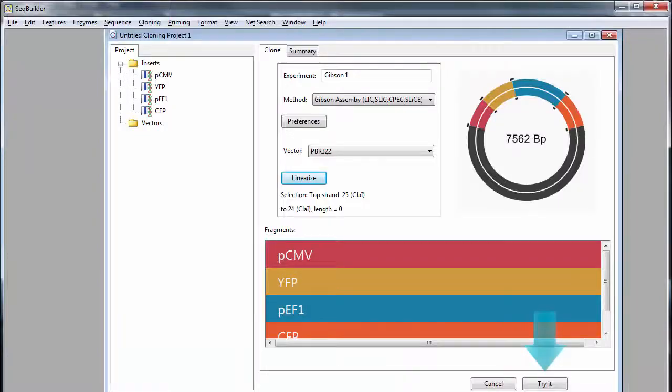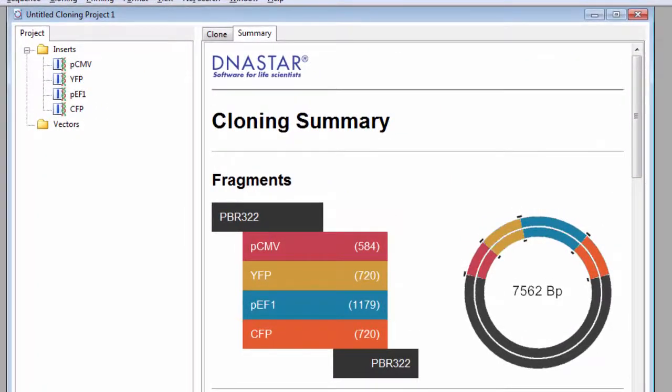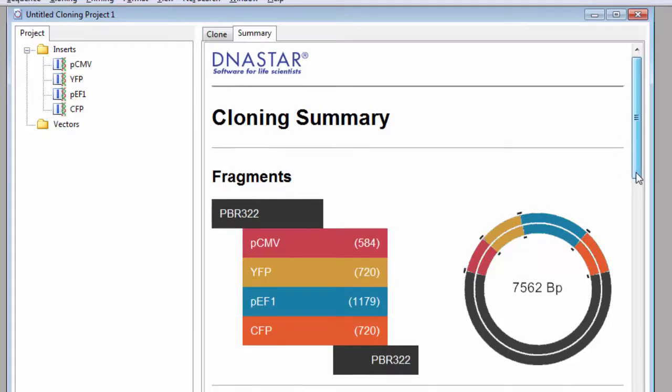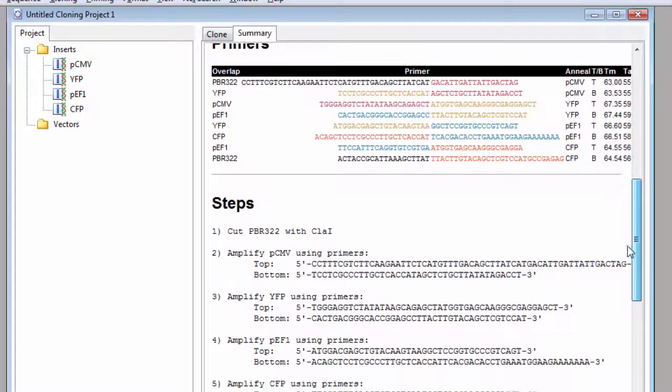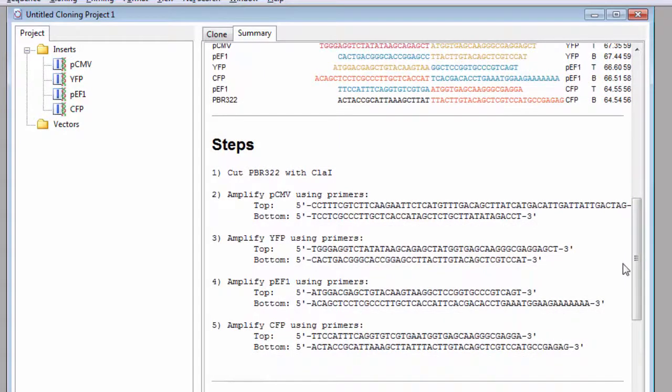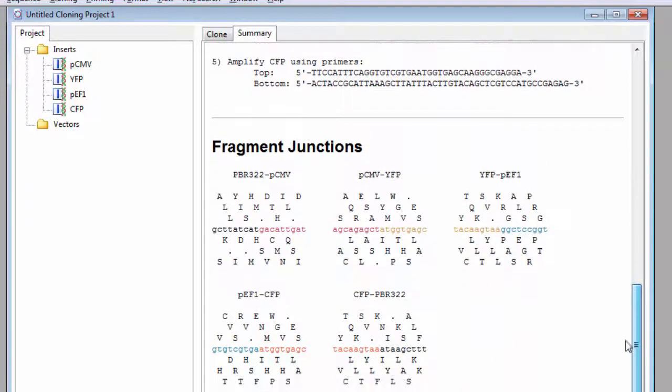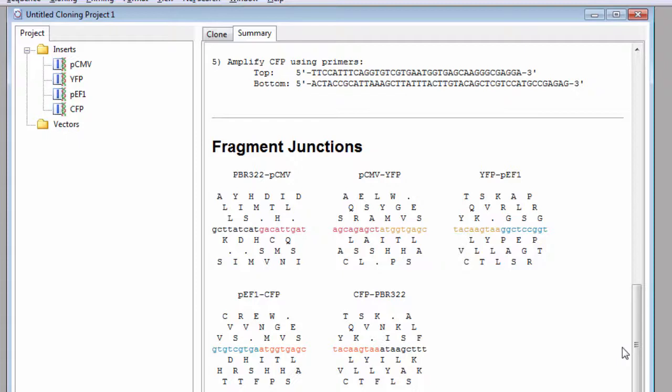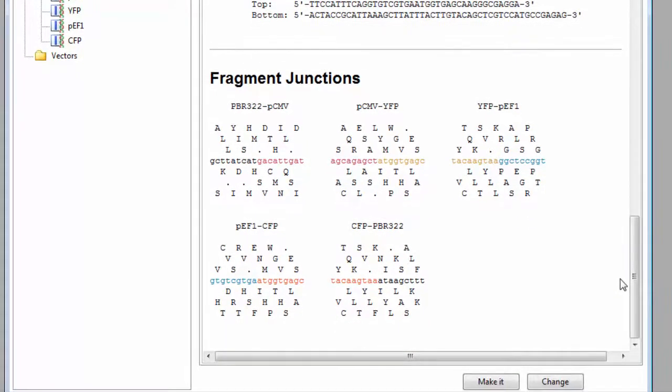Click the Try It button to see a summary of the project as you have it set up. Here we see details about the fragment inserts, primers, the steps needed to prepare the vector and amplify the inserts. And you can also see the reading frame around all fragment junctions graphically, allowing you to verify whether promoters and genes are in sync.